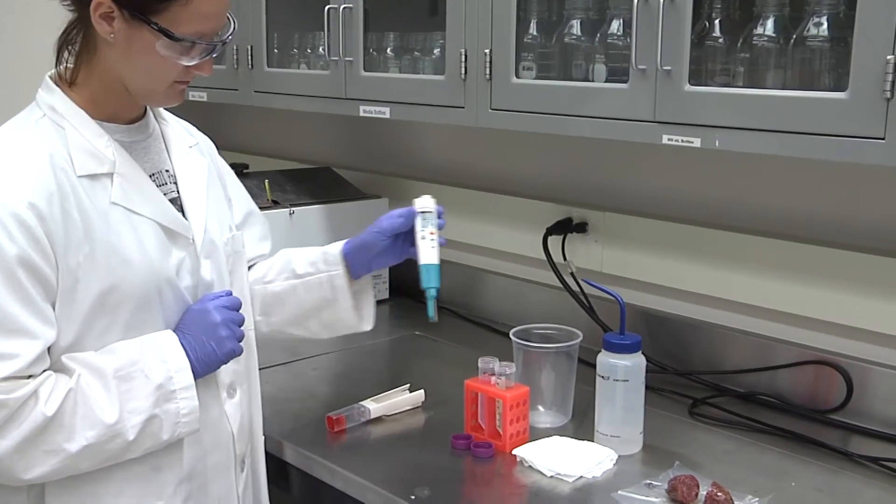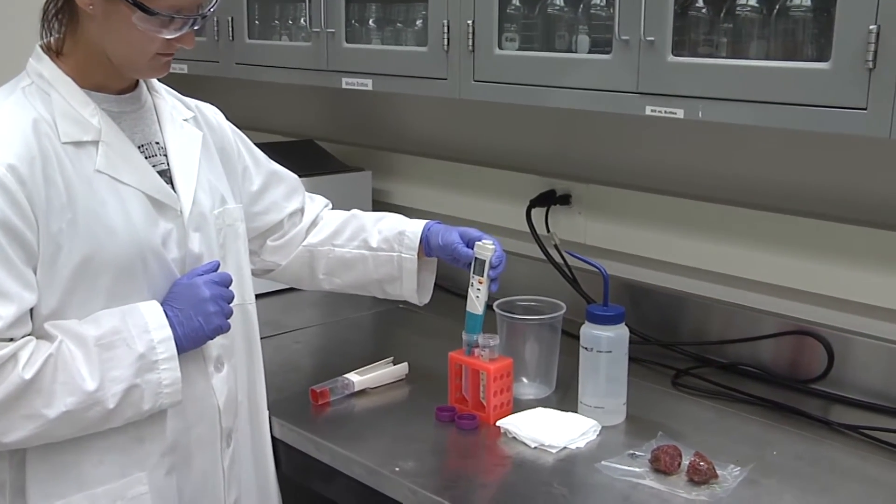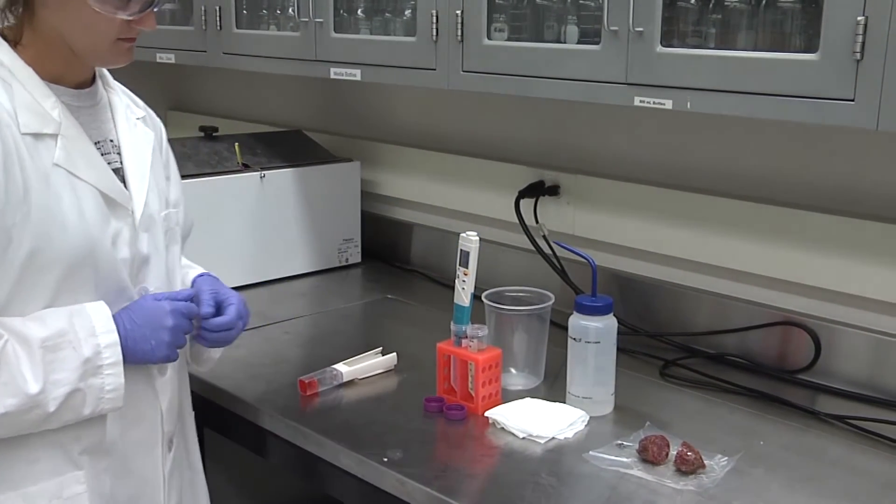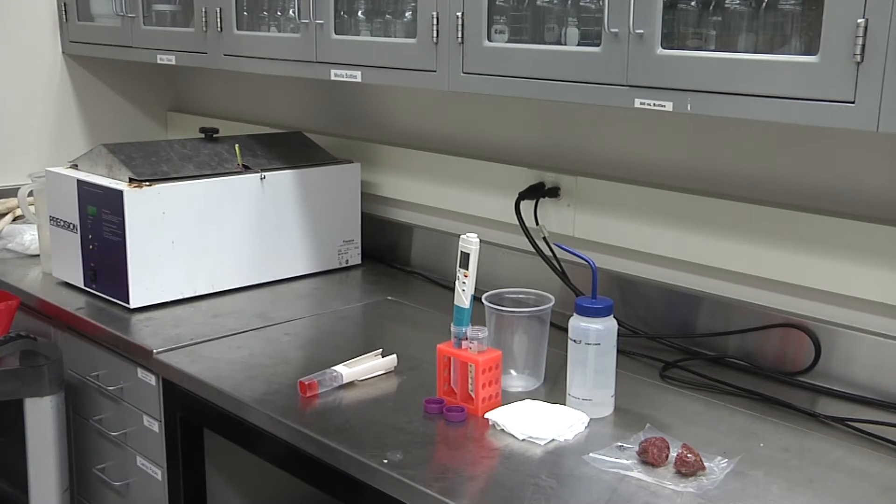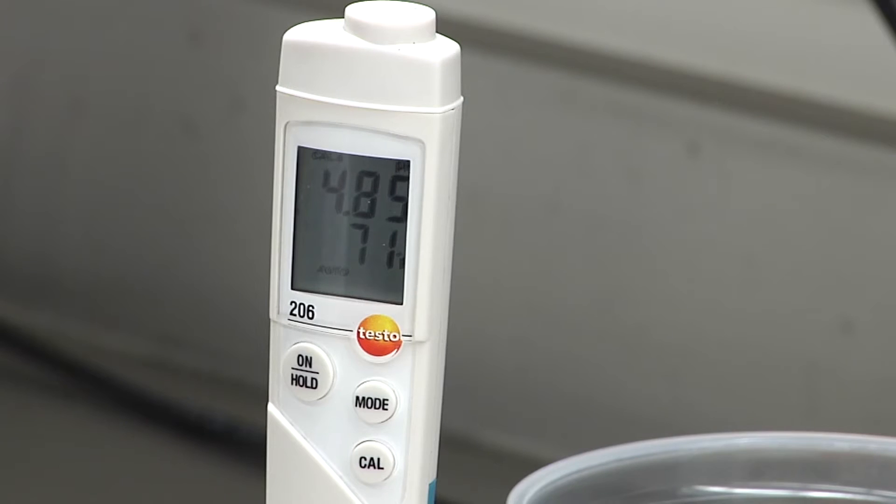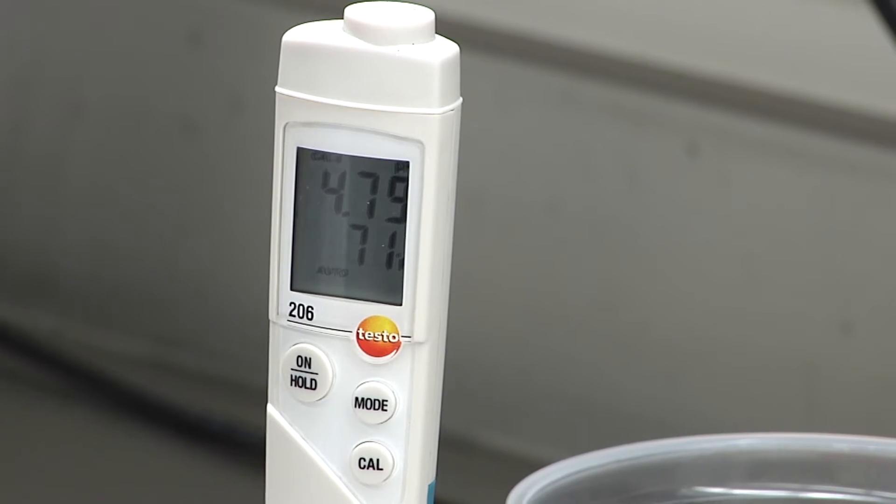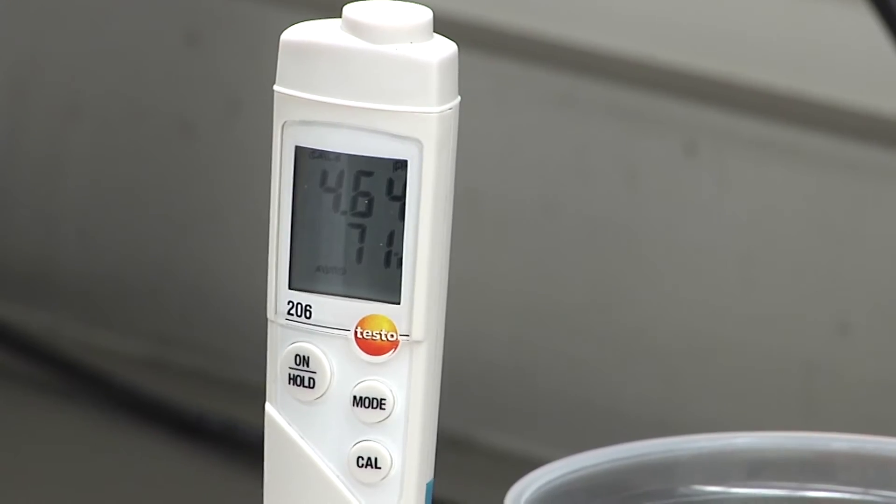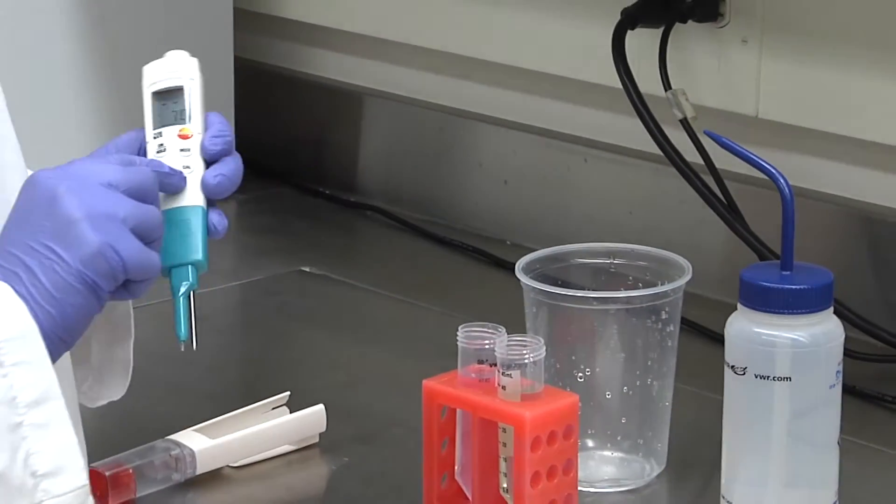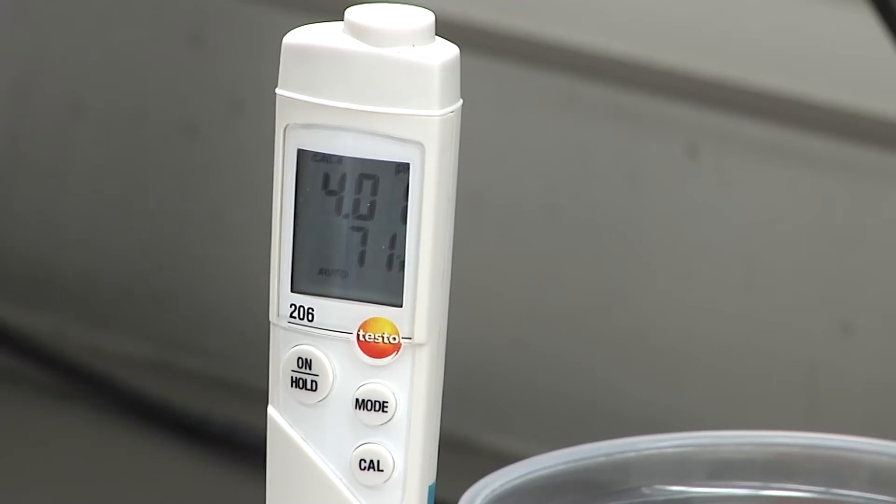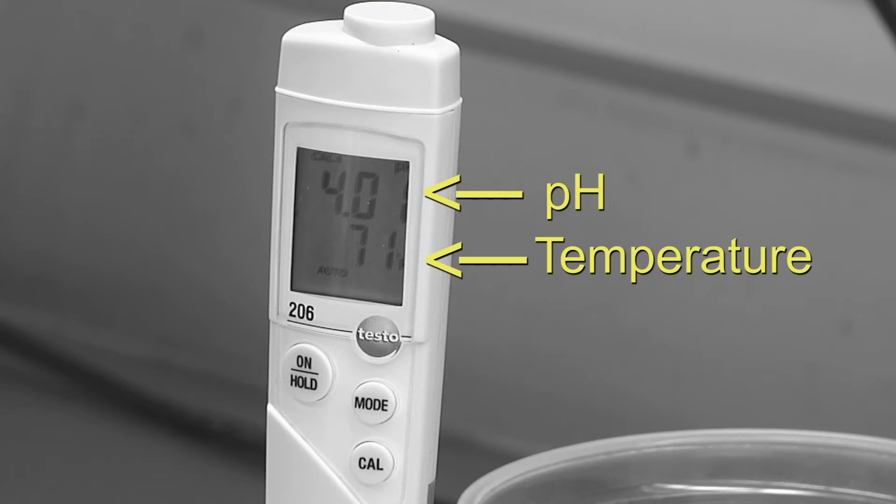Most pH meters have an automatic calibration function. As long as the automatic process continues through to completion, the results of the calibration will be more useful than trying to calibrate your apparatus manually. When calibrating your meter, be sure to use fresh buffers in the appropriate range for what you are measuring. Typically for meat products, the meter should be calibrated with pH buffers 4.01 and 7.00.